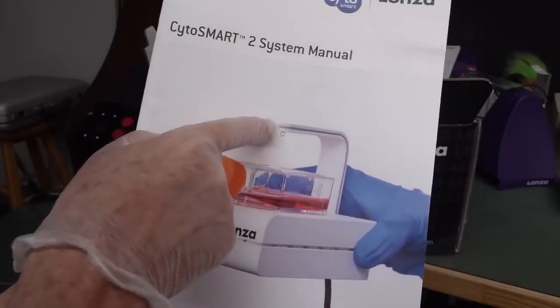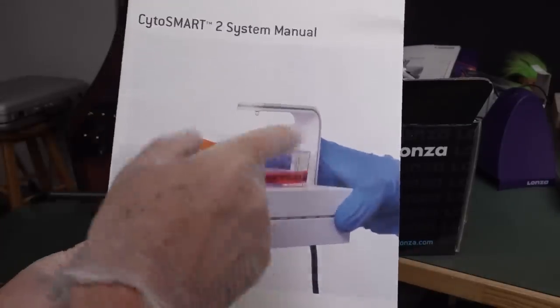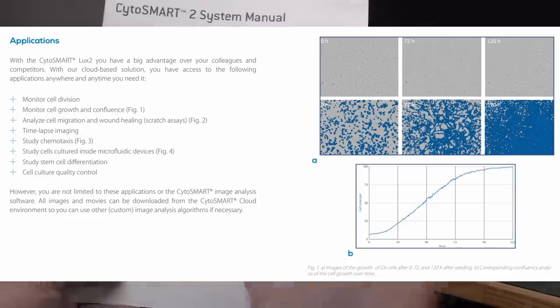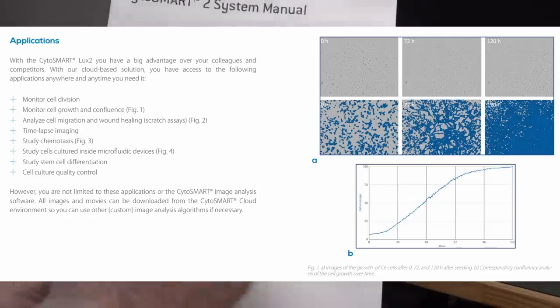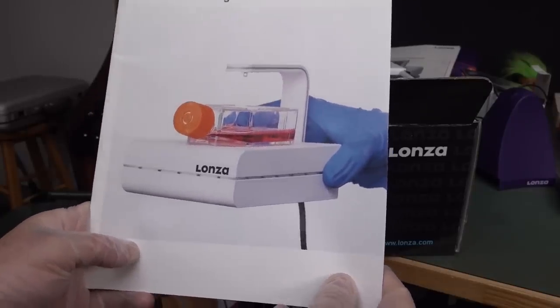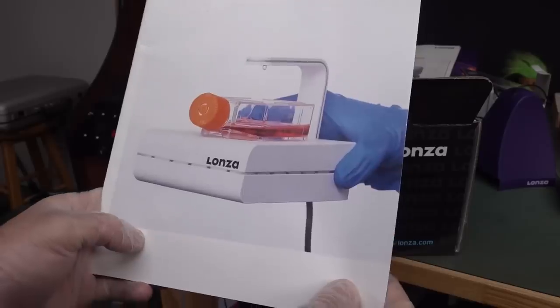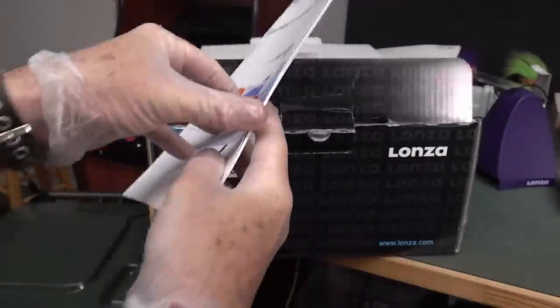So obviously there's an LED source up here. It's probably better than just a normal LED. It's got, I don't know, some fancy spectrum or something. And it could just be UV or something like that. Who knows? But anyway, you put the vial in there of whatever liquid. It's red, but I don't think it's blood. And you put that in there and there's some sort of detection camera on the bottom.